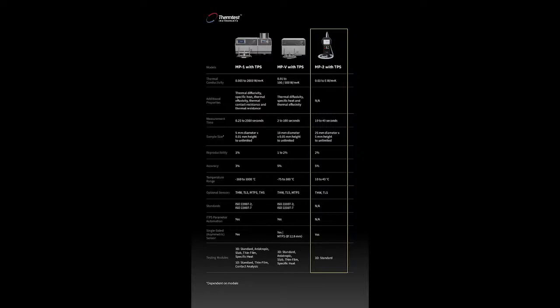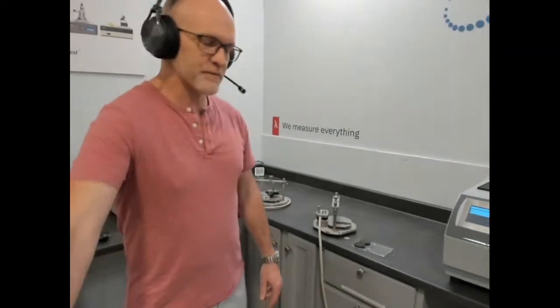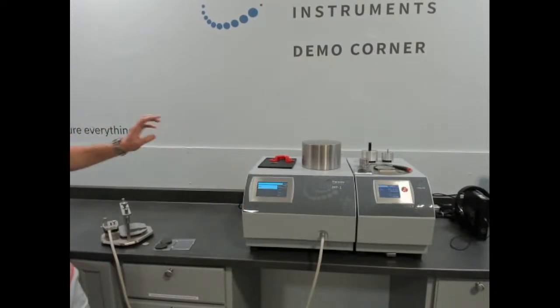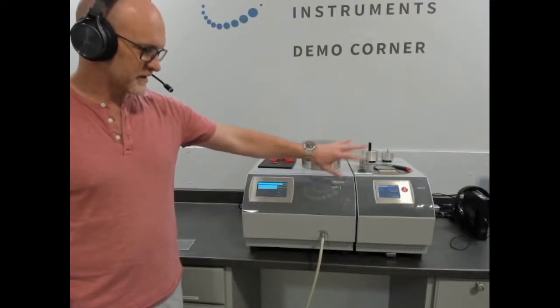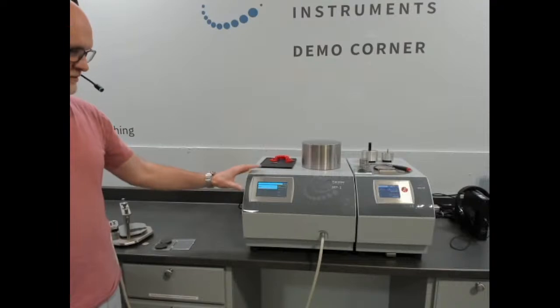So I'm going to move over to the MP1 and show for each measurement platform how you can measure with the transient plane source in a general way. So let's switch cameras. First we're going to just mention MP1. So this is our MP1. It's our advanced model. It has a 4-channel controller that you can connect room temperature sample holders, as well as the temperature platform, which is available in different ranges. All that can be controlled with the same controller. So this is like having 4 units side by side. We describe this as future-proofing your thermal conductivity needs.